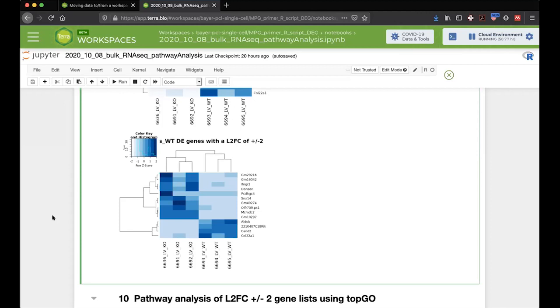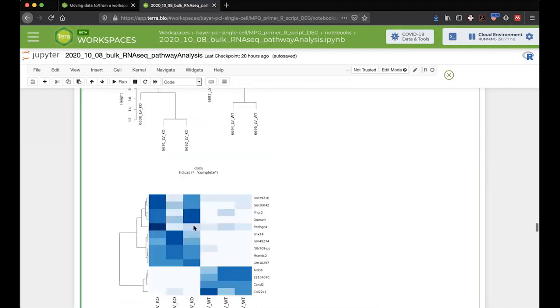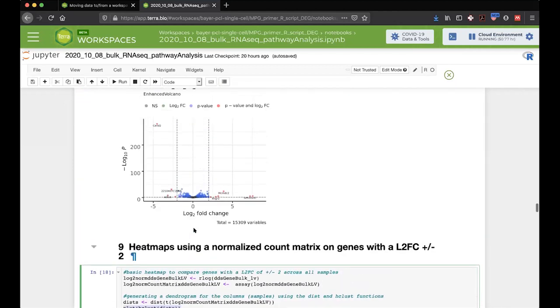I think about that as transcripts per million at that point, because you have to be thinking about things in that way in order to compare one sample versus another sample. Yep. And then you're using a weight. Oh, and then there's the RPKM, which actually takes into account the length of the transcript, which obviously is not in all normalization approaches. Yeah, and if I remember right, DESeq2 does take this into account.